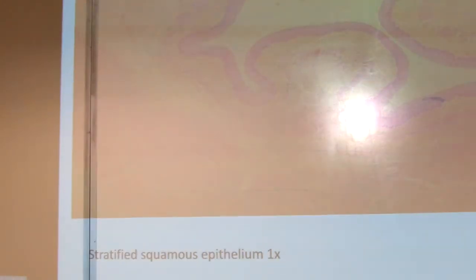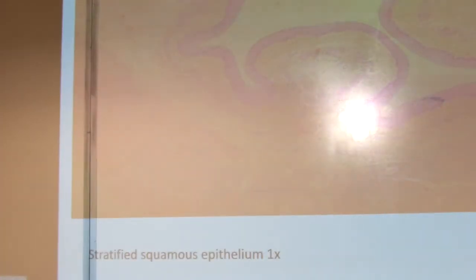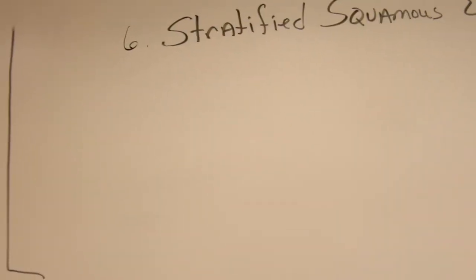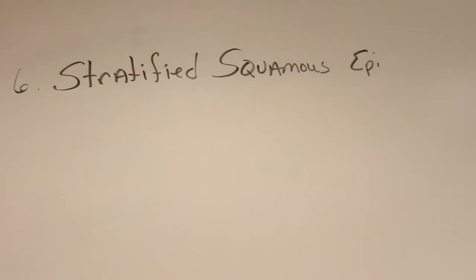All right. Let's go to our next tissue. Finally, for the first time, we have truly stratified squamous epithelium. Okay?